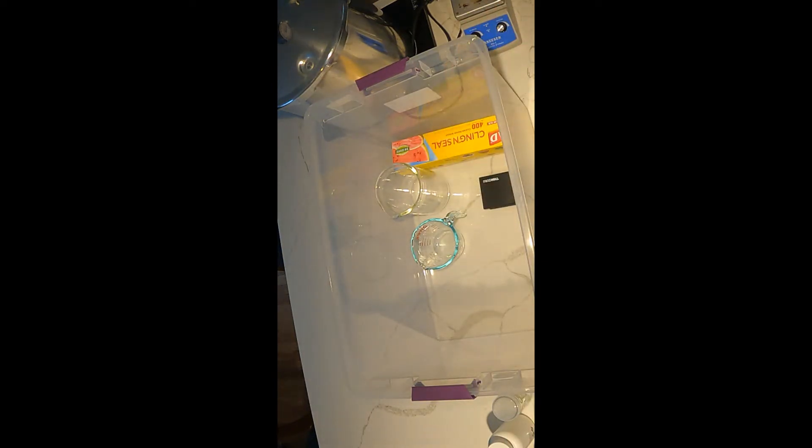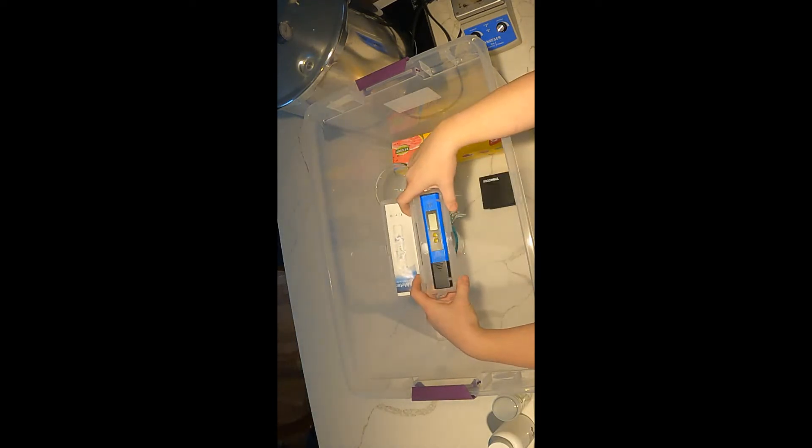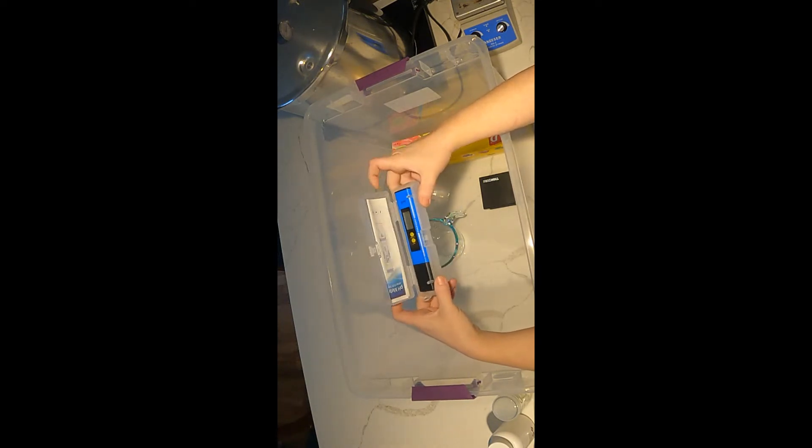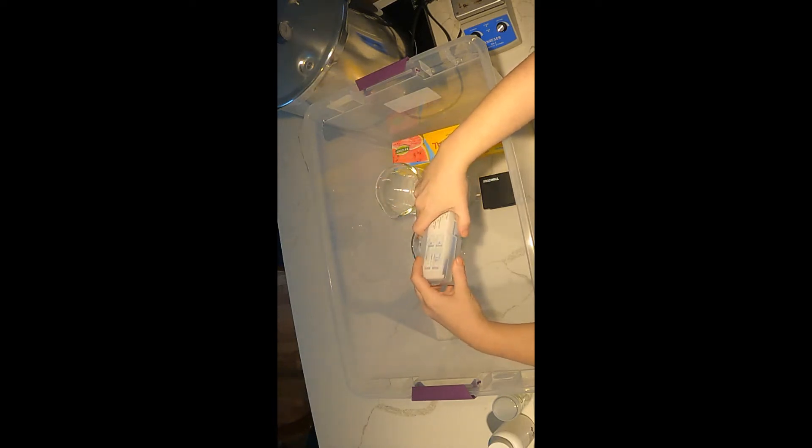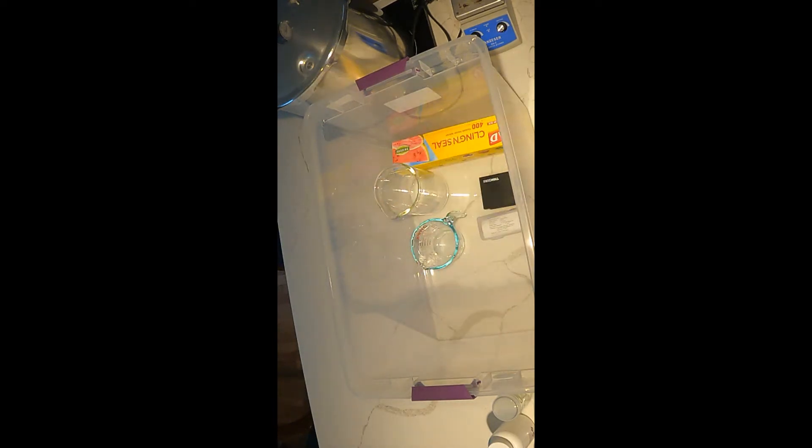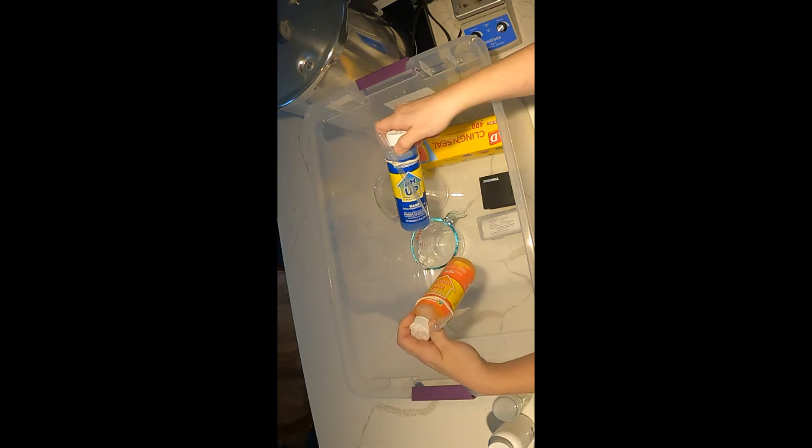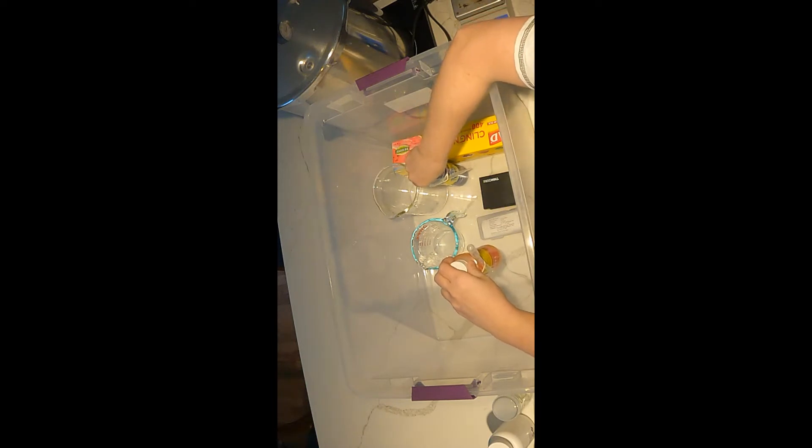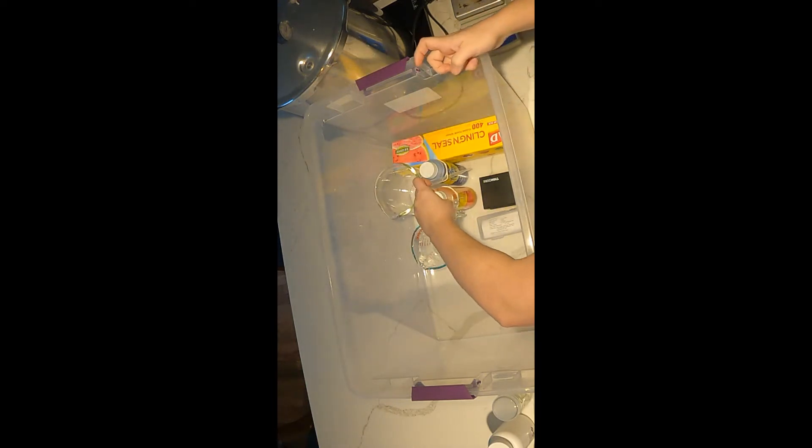You're going to need a way to measure the pH. The media has a tendency to be acidic. I will be using an inexpensive meter. You can also use strips. You don't want your media to be too acidic or your plants won't grow. Now that you know the pH, you're going to need to adjust it. I use hydroponics pH up and down. You can also use baking soda and vinegar. Baking soda would be the equivalent of pH up and vinegar would be the equivalent of pH down.